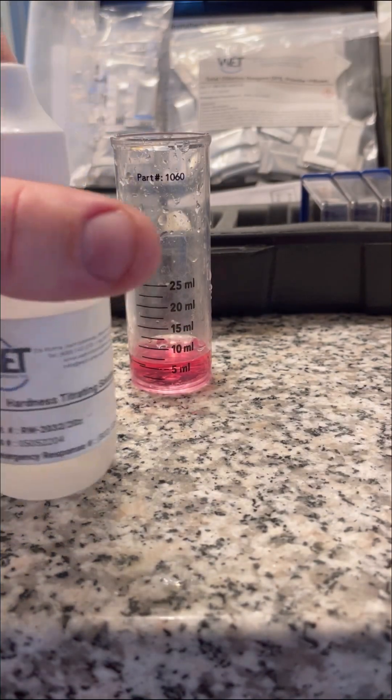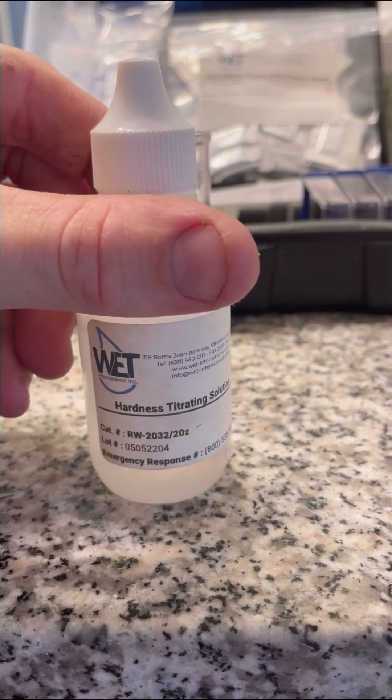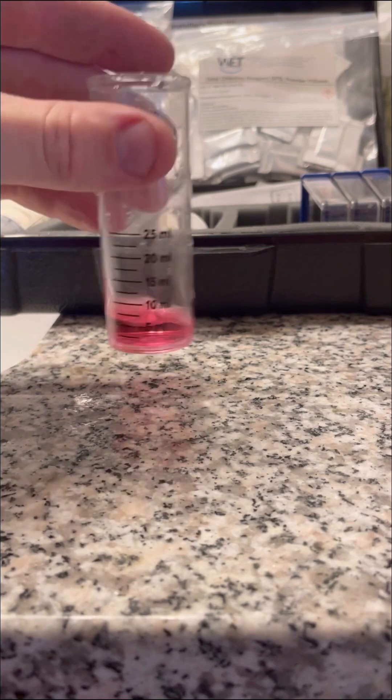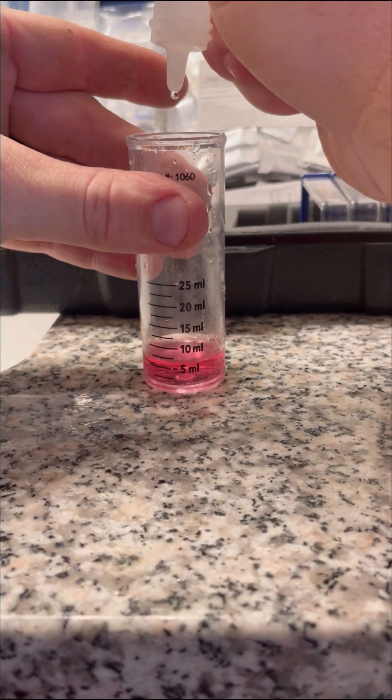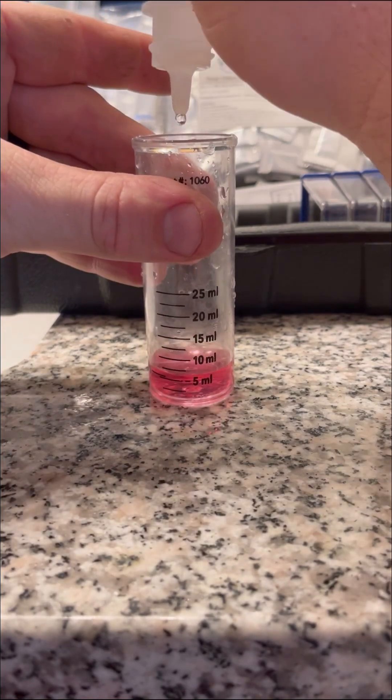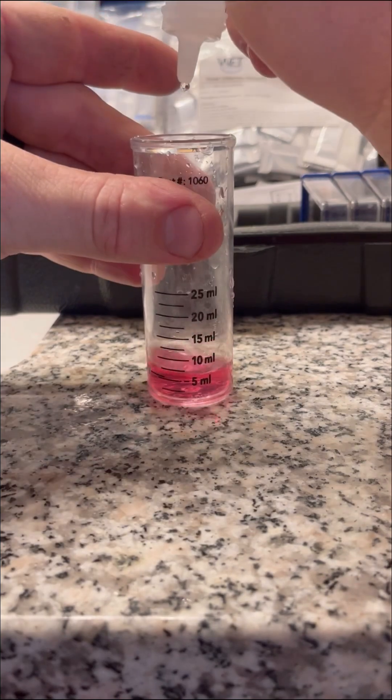Since the water to this home is not soft though, the water sample will turn a pink color. From here, to determine how hard the water is, we begin adding drops from this second solution. Each drop indicates one grain per gallon of water hardness or 17.1 parts per million. Once the water sample turns blue we know to stop, and that's how hard the water is.